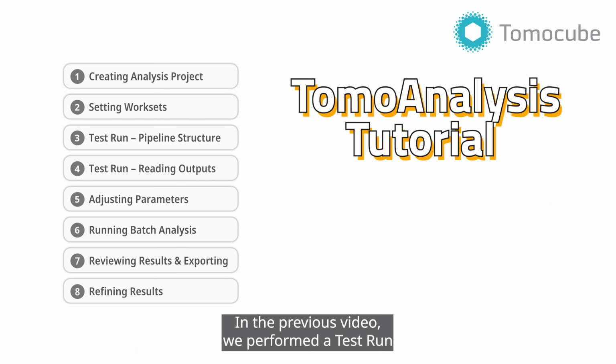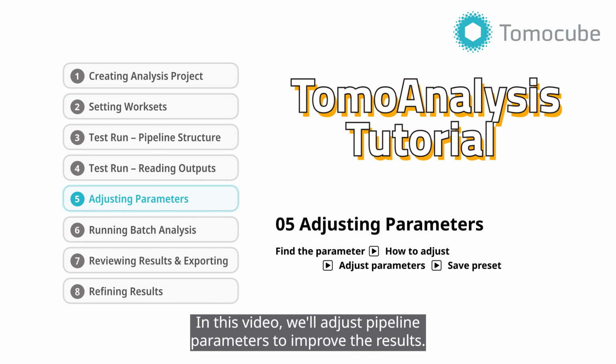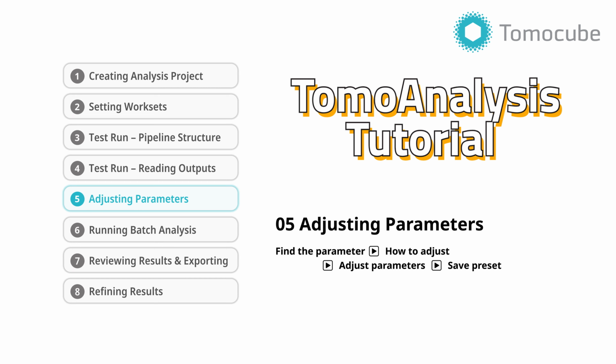In the previous video, we performed a test run to evaluate segmentation quality. In this video, we'll adjust pipeline parameters to improve the results.